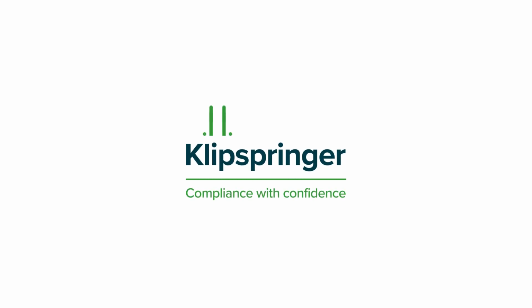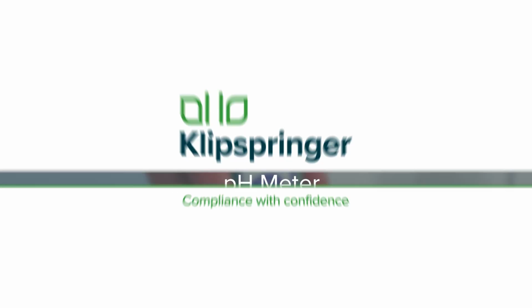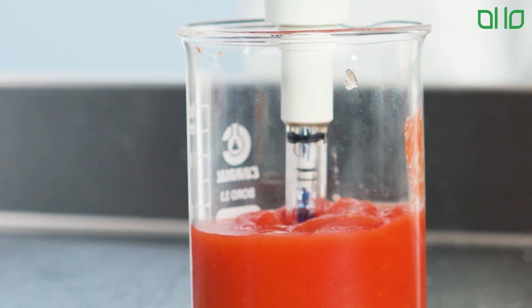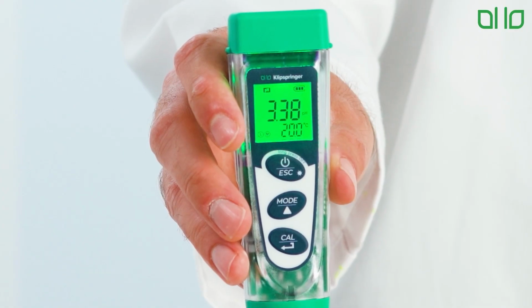pH meters play an essential part of food safety and quality control within the food industry, ensuring you stay compliant with customer and BRCGS standards. In this short tutorial video, we'll take you through a step-by-step guide on how to use a pH meter. The example unit we are using is from Klipspringer's pocket tester range.